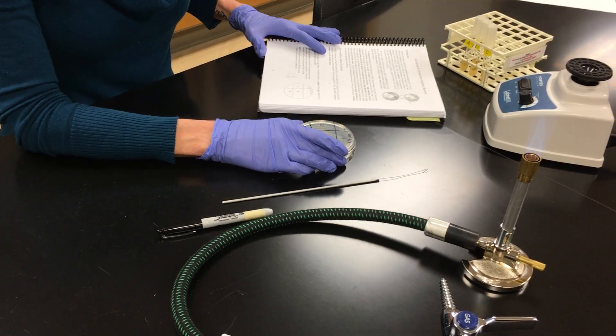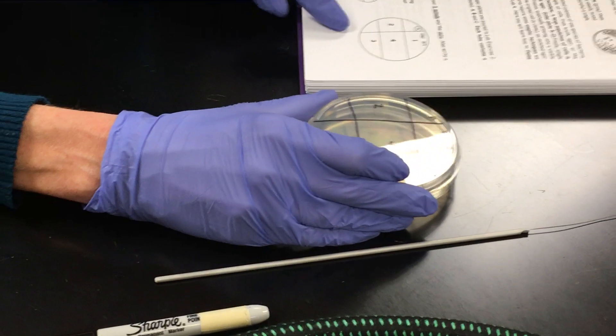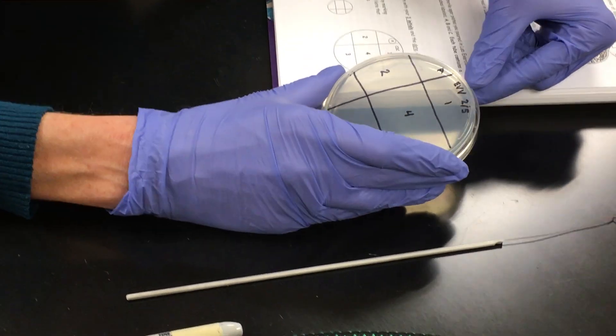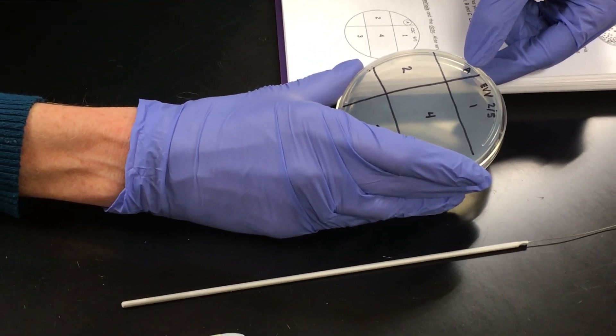So the first thing is we are going to label the bottom of our nutrient agar plate just as it's written in your lab book. So notice I have my initials, I have my date, I'm going to go into culture tube A first, so I've labeled this plate A.